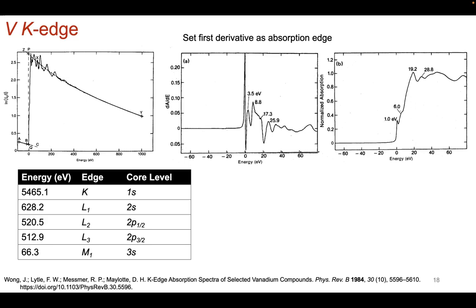But anyway, you would set this energy as the 0 energy, and that's what you see here. So now the absorption energy is 0. Anything before that will be the pre-edge. Anything after that, higher energies, will be the post-edge region. Okay. So you see here the probability. This is the absorption energy set as 0. Before that, for just vanadium metal, there is basically no pre-edge, but just the absorption energy here, and then all these multiple scattering type signals that you can observe.